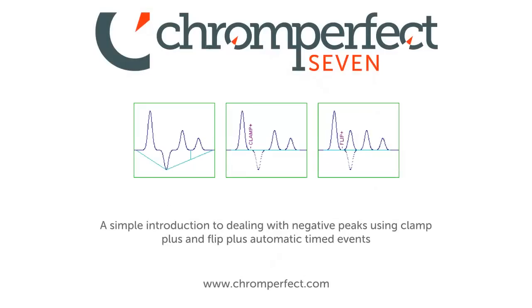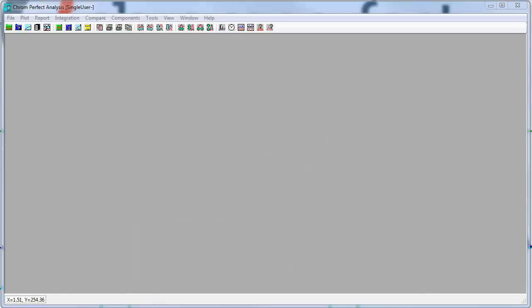Hello, today we're going to be looking at a couple of automatic timed event commands which enable users to deal with negative peaks within Chromperfect chromatography data system. We're going to be working within the Chromperfect Analyze program and looking at the flip and clamp commands which allow users to deal with negative peaks.